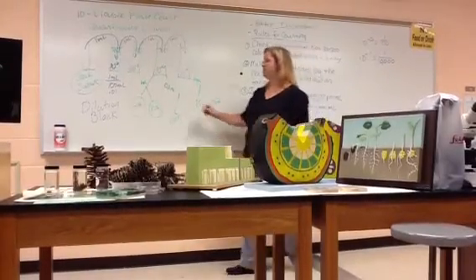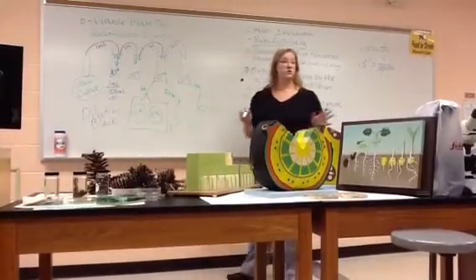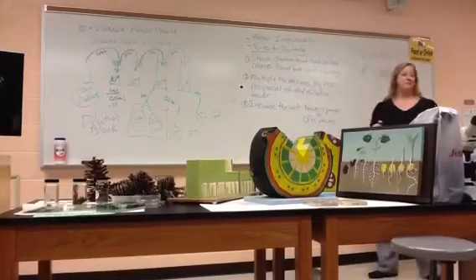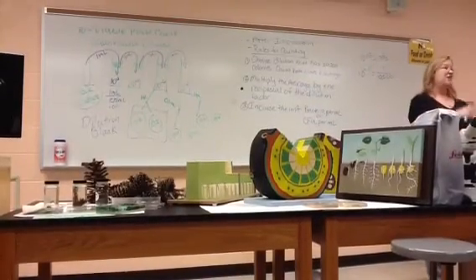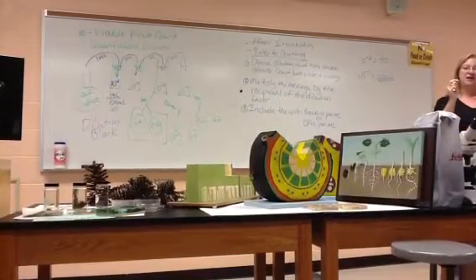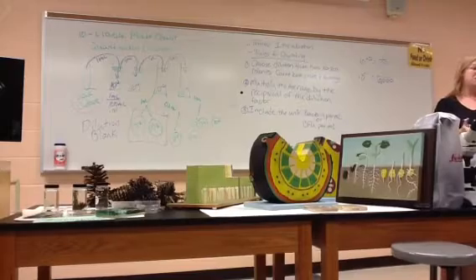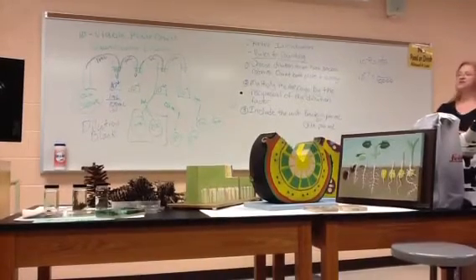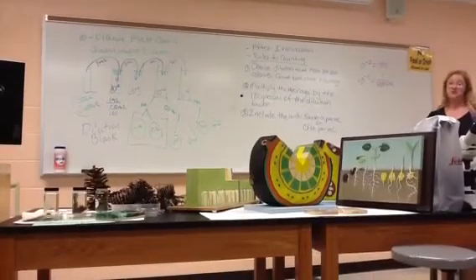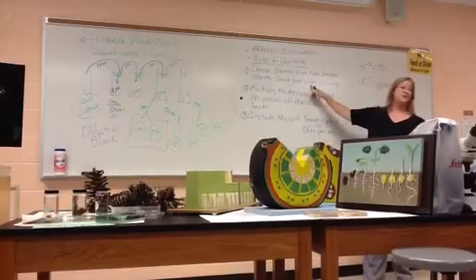And let's just say that you chose, for the sake of argument, 10 to the minus 6, just so we can do an example. Then you actually have to count them. Yes, every little dot on that petri dish. A lot of people take a fine magic marker and make a dot on each colony as they're counting them, so they know how many they've counted. So aren't you glad you don't have to do this? You don't have to count, but that's what you would do. You literally count every single colony on both plates.